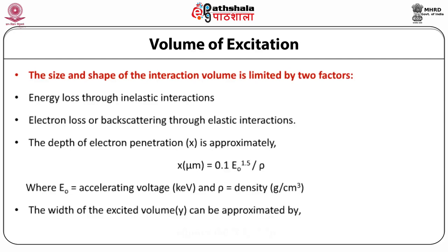The width of the excited volume, which is y, can be approximated as y equals 0.077 E0 to the power 1.5 divided by rho.